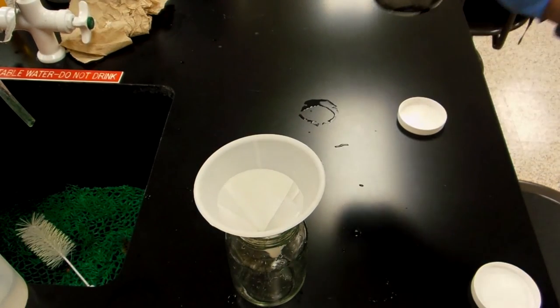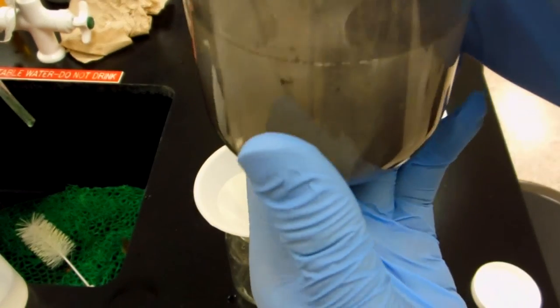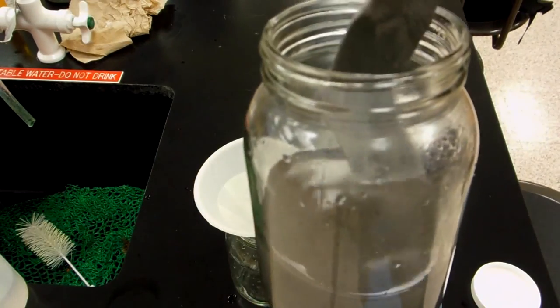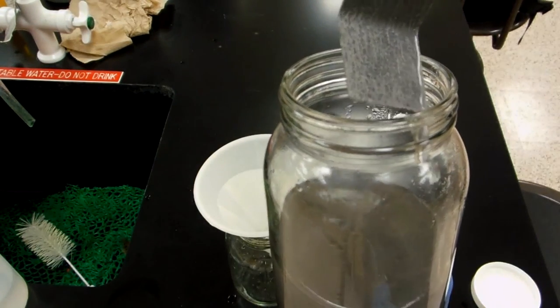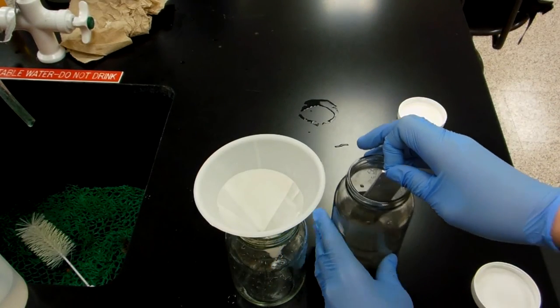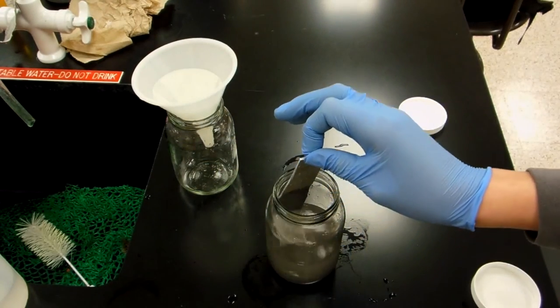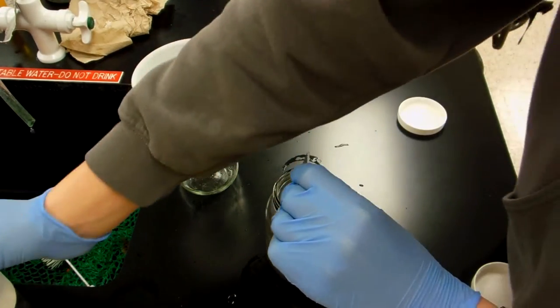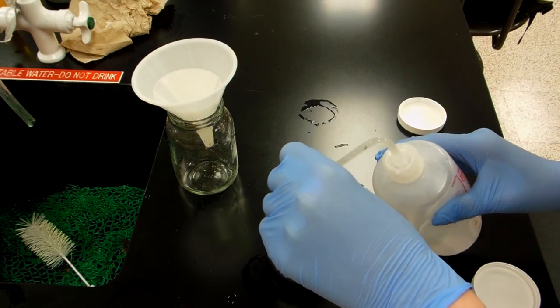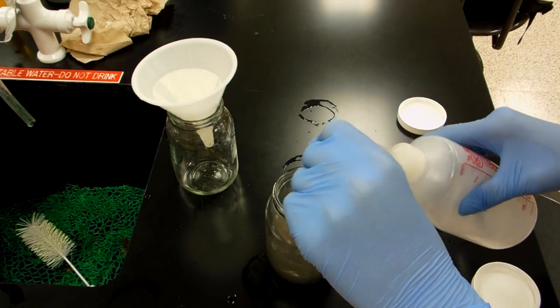So, now, as you can tell, this is a little later. I removed the aluminum from the jar where the solution was in, and I will use the wash bottle and rinse the aluminum to remove any additional possible silver that might be on there.